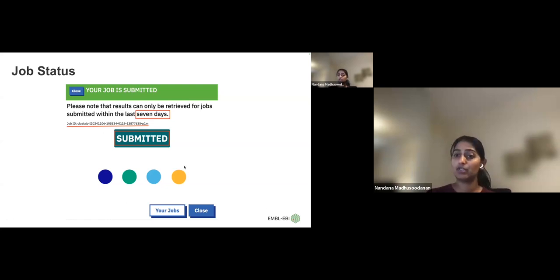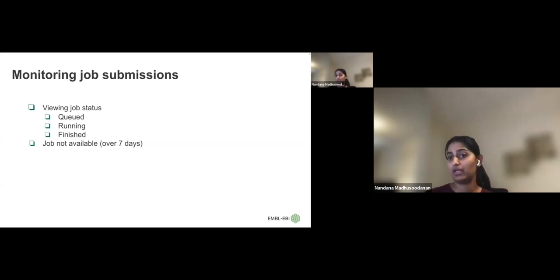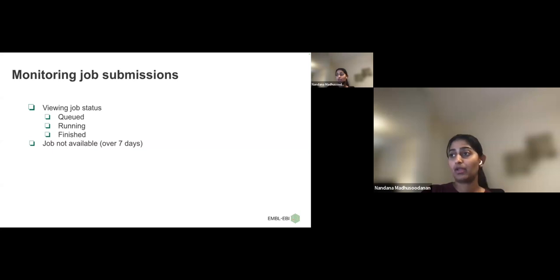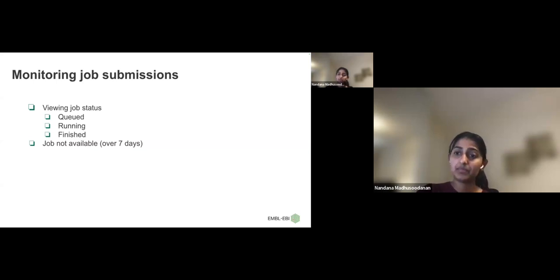Once you submit the job, you get a panel with a job ID and different status indicators. 'Queued' means the analysis has not yet started because our clusters are busy. 'Running' means the analysis has started. You get results once it's finished. If you try to access a job older than seven days, you'll get a 'job not found' error, because we store results on our server for a maximum of seven days. Make sure to download your results if you need them later.